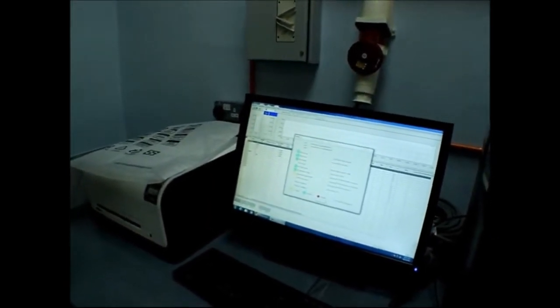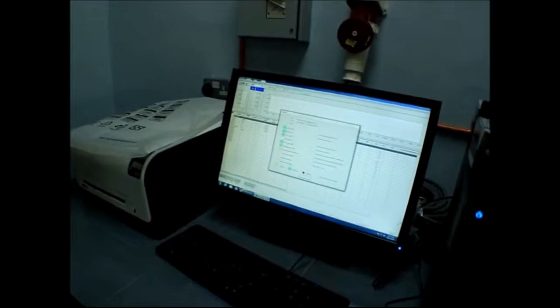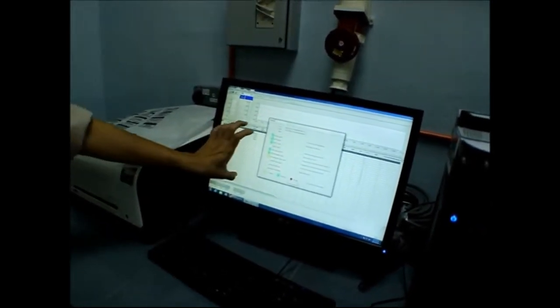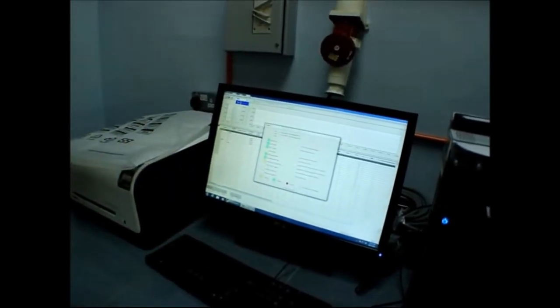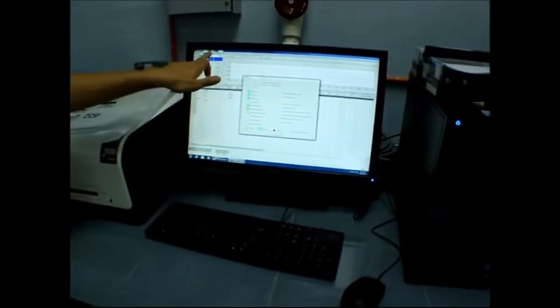You can connect in two ways. One is when I set, then they will ask me whether to connect or not. But this one is a template, I call the template, then I will need to manually connect. How do you connect again? What do you need to press? Instrument, connect. Click instrument, connect.